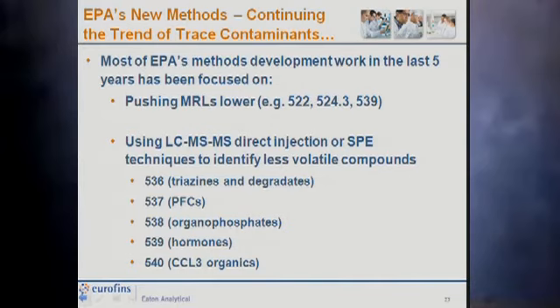And then the other thing that's been really happening within EPA in terms of compliance methods is using a lot more LCMS. Bill Buddy in the audience here was doing LCMS methods for EPA 30 years ago, but the techniques then just weren't where they are now.